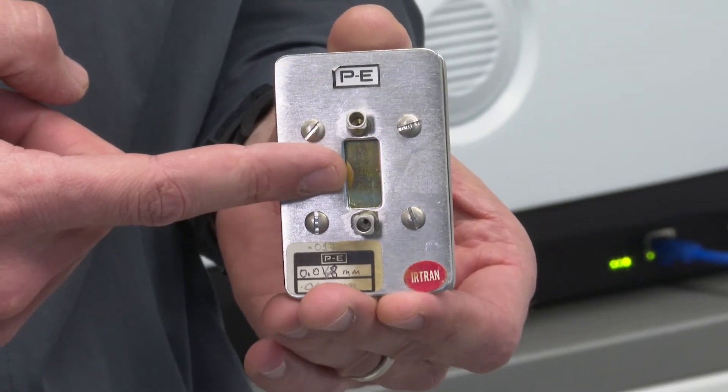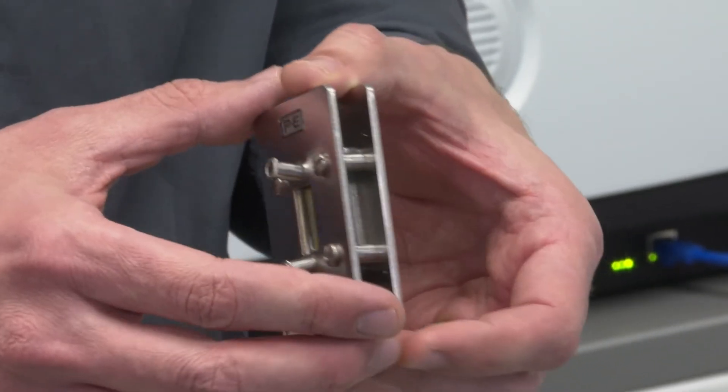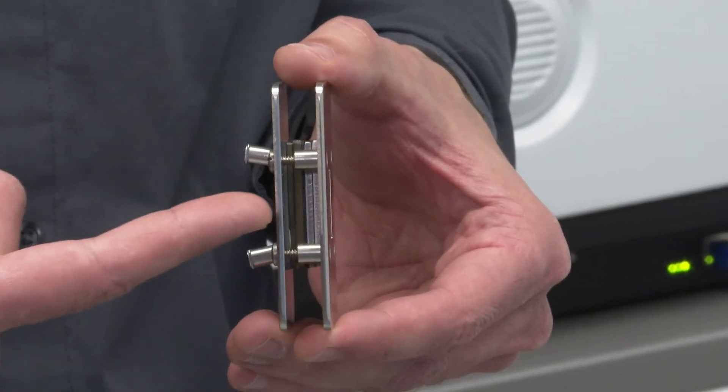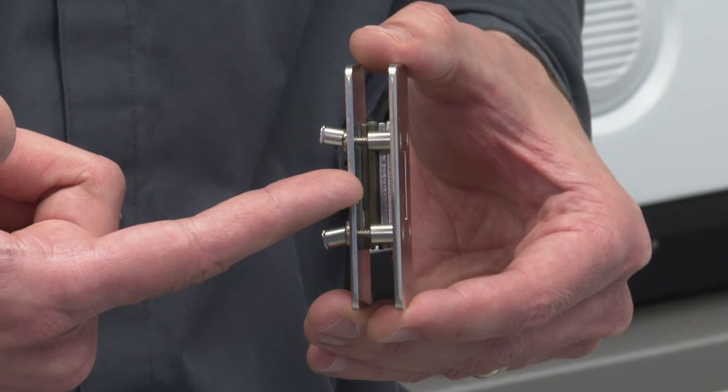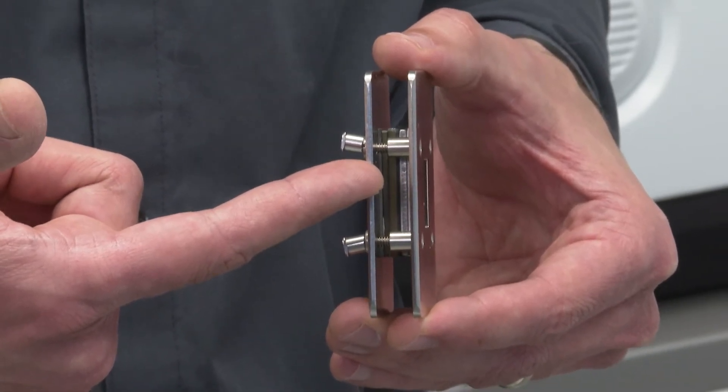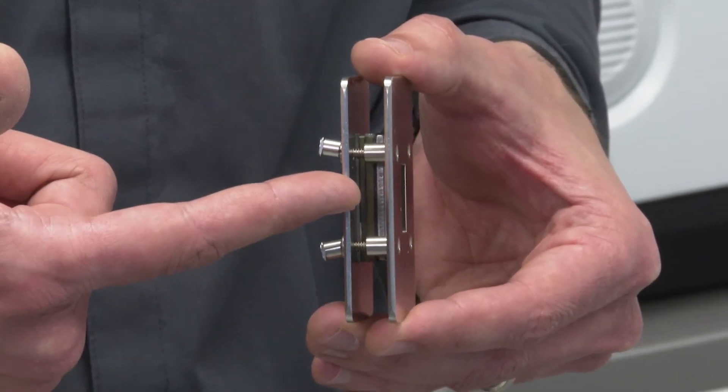There are also considerations of material compatibility. The path length of the cell may also be changed by changing out the spacer. By changing the path length, you can optimize sensitivity for your material or parameter of interest.